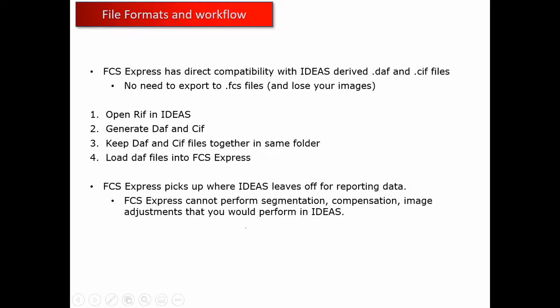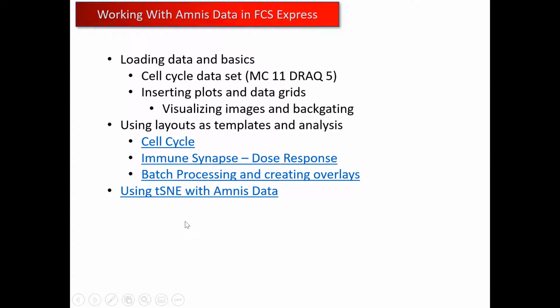Those are all things that should be done in Ideas software. So we're going to take a look at that in FCS Express itself, loading some of the data and the basics to get started. We're going to show you that with a specific data file. We're going to teach you about inserting plots and working with data grids, how to visualize images, how to do backgating, and then we're going to come back and take a look at a few layouts and templates for analysis that we think are good uses of using the software with Ideas data.